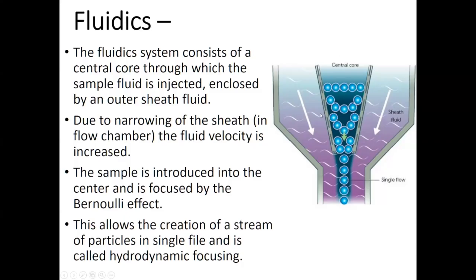Now, practically imagine, in a 360 degree angle, you just imagine when the sheath fluid is running so fast, okay, what happens in this area? The speed increases or decreases, or the velocity increases or decreases?